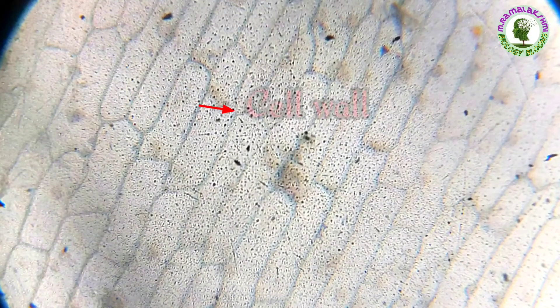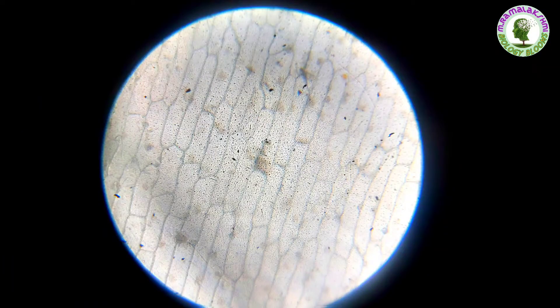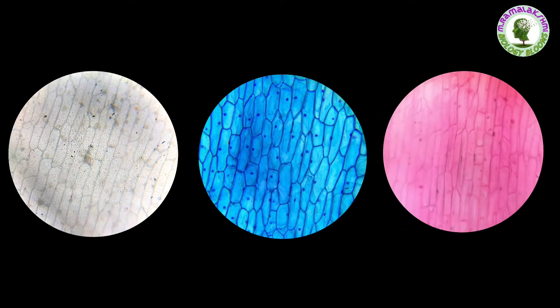This is the cell wall; this is the nucleus. If we stain the specimen in methylene blue or safranine, then we will observe it more clearly.